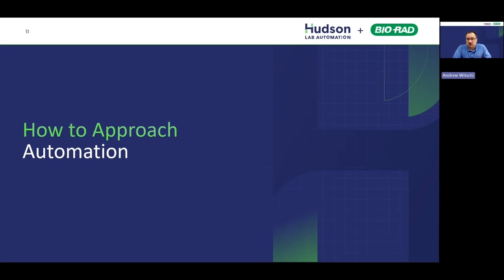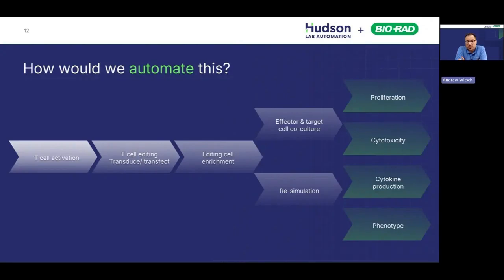All right, so with that context, why don't we move into some of the tools and thought processes that we can use to put the automation in practice. Going back to what we're trying to do in labs, this is an example research process used for T-cell therapeutic development. All right, so this is clearly high level, abstract, but comprehensive. Right? When you're looking at what's happening in the lab, all of these things need to occur.